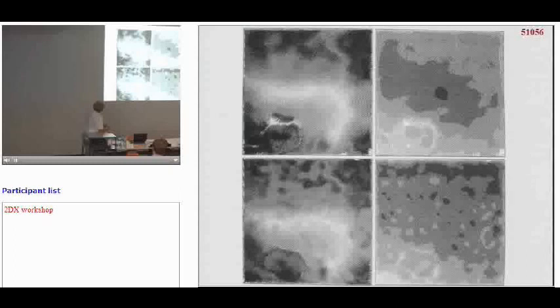So you use the reference area to unbend the image, just like I showed on that first slide. And then you've unbent it, you correct it better, and then you average the whole image and get a much better corrected reference area. And then you do the unbending again, which is bottom right here. The reference here was about 100 unit cells in the middle. The reference here is the whole area, properly averaged and corrected for all the phases. And so what you then get is cross-correlation peaks. As you go, this is basically almost in focus, so you have almost no contrast there, or only at very high resolution. So the peaks are very weak.